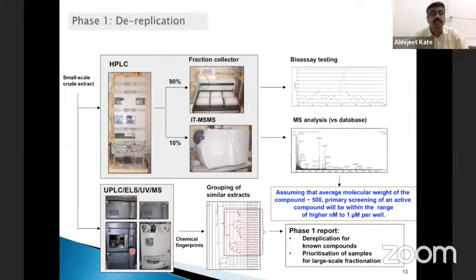One of the instruments is referred to as UHPLC, written beside the advanced HPLC, where we can have good speed. This is ultra high performance liquid chromatography, as people refer to it, and it can be connected with smaller columns with lower particle size.